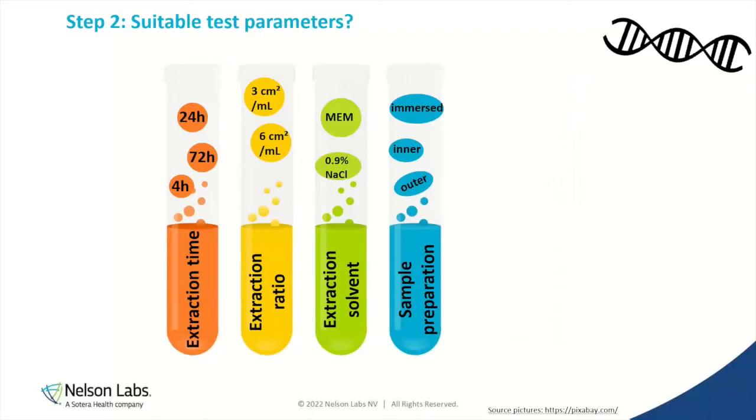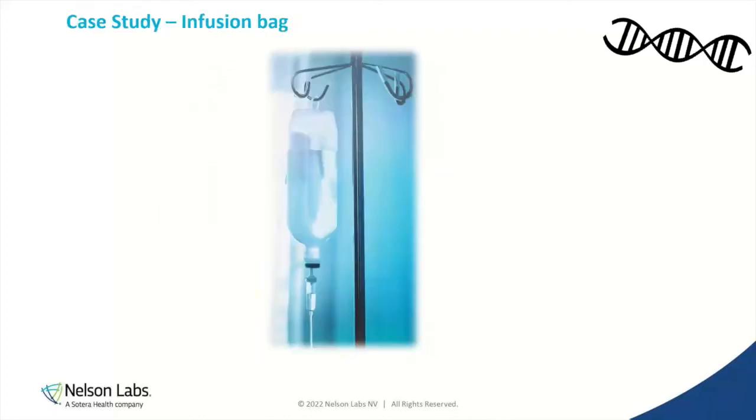Another thing we want to think about in the parameters is how the device was extracted versus how it's used clinically. Again, thinking about an IV bag, this gives us all those perfect situations we want to talk about. If we immerse an IV bag, we would just cut it up and put it all in fluid, inside and outside. But that's not how it's used or how the patient will be exposed to it. So it makes sense to only extract the inside portion. And in this case, we would also use saline if this was a saline-only IV bag. So just an example of when those things could be considered, so it relates clinically to the use of the device.